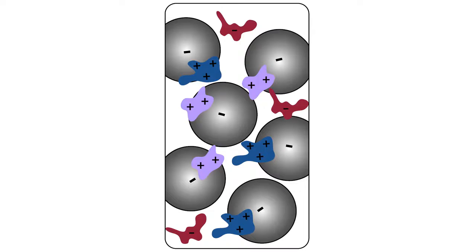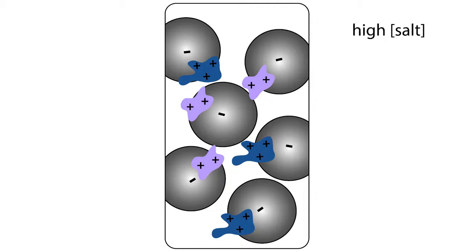I can now take that same protein and I can do one of two things. So here's an example. Here are those three proteins. Here's a blue one, a purple one in the middle, and a red one. And you saw from before the red one flew right through, right? Because this had the wrong charge. But the blue one and the purple one, they're kind of stuck, and I want them to come off. So I change from a low salt buffer to a high salt buffer. That high salt concentration helps to shield the charges on that column. And that now allows the proteins to come off.